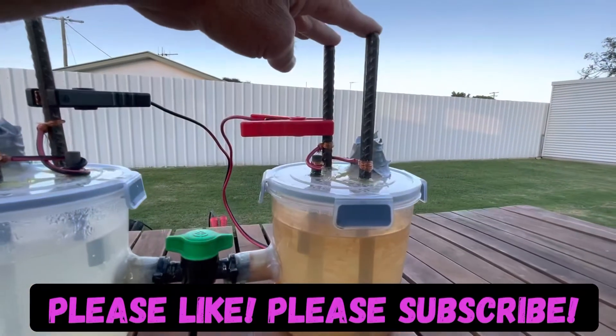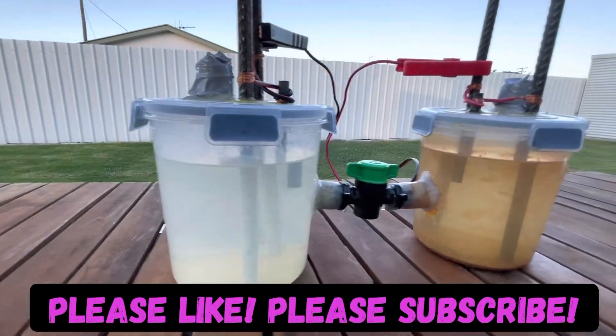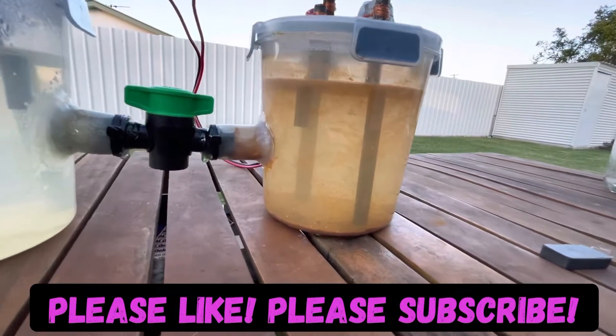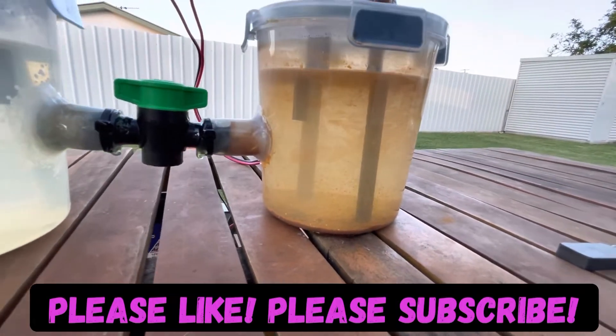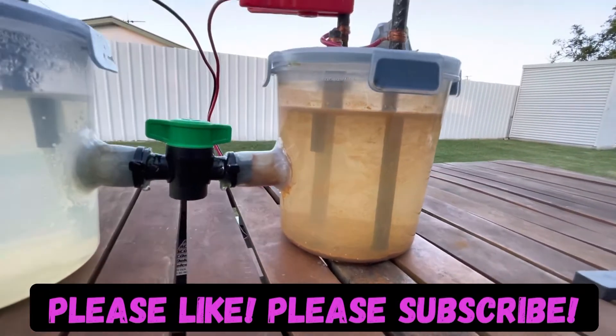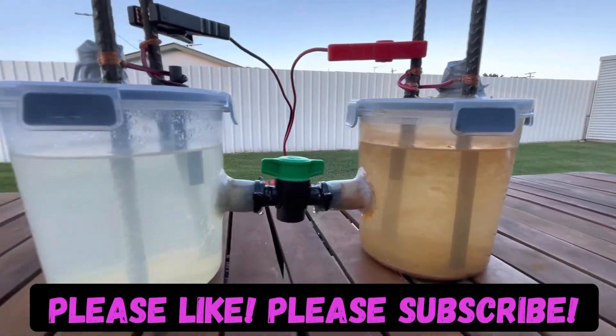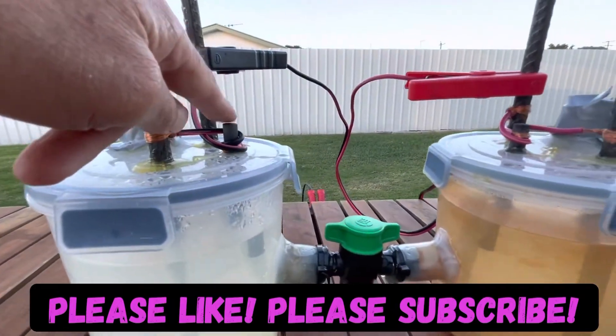It's the last time I use iron rods to do electrolysis with. As you can see, that's why you don't do it — it's purely because it produces so much rust and oxidation on that side. Next time I'll let this run its course and then remove these iron rods and replace them with more carbon rods — like these carbon rods here.